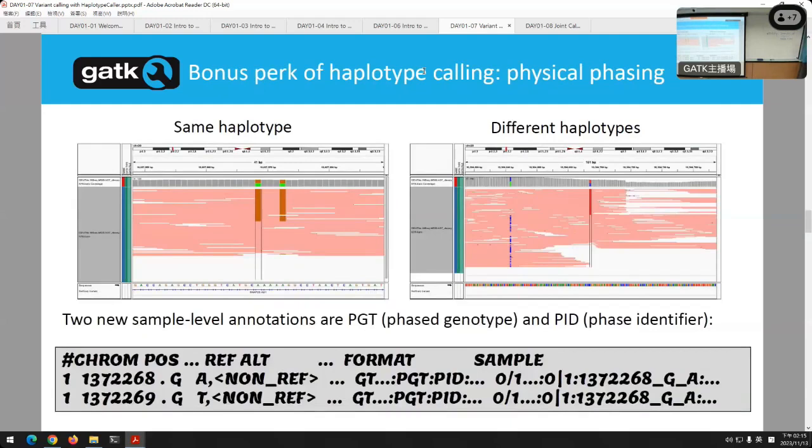And one other important thing with using the graph, this is very important for understanding how mutations can affect their samples, is you can phase. Phasing means you could take multiple mutations and tell me if they're on the same haplotype. Haplotype is just a swath of a region of DNA.